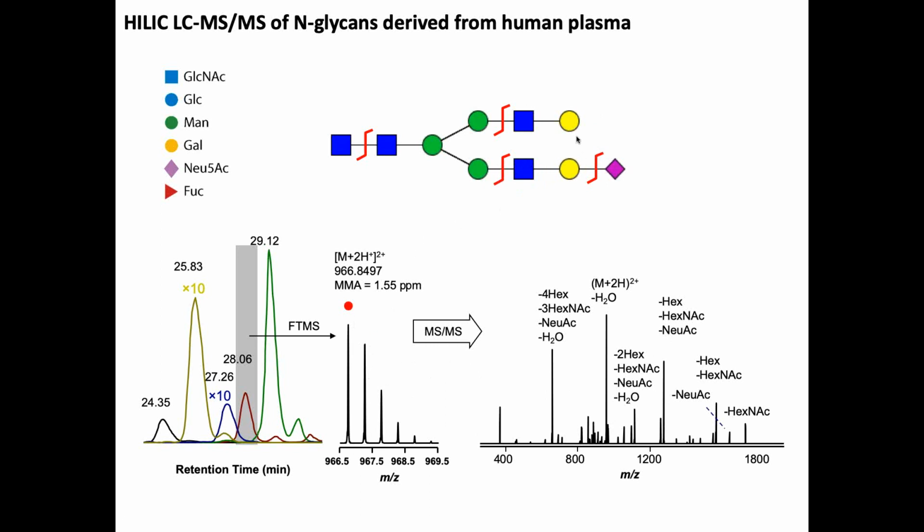On this newer system, the Lumos, you could do high energy collision-induced dissociation. You could do MS to the n, multiple levels. After you get this fragmentation spectrum, you could isolate each one of these peaks and do additional levels of MS/MS. Fragment this one, fragment this one. So there are a lot of different levels of complexity that you can get into with the newer instrumentation.